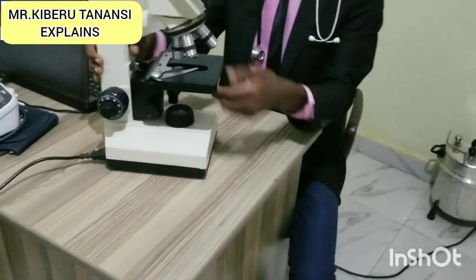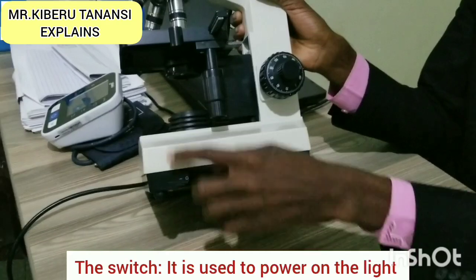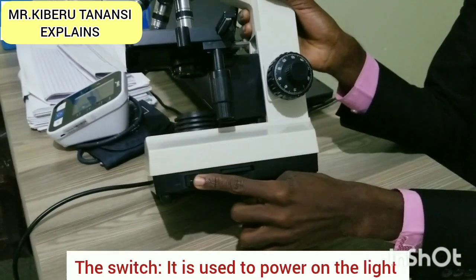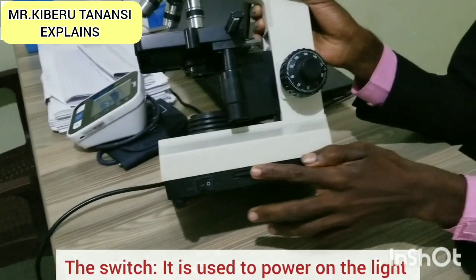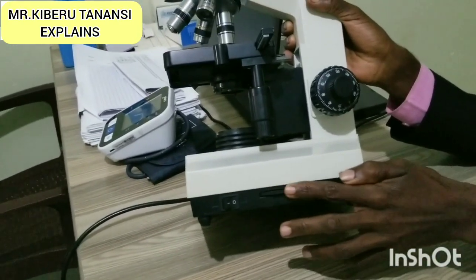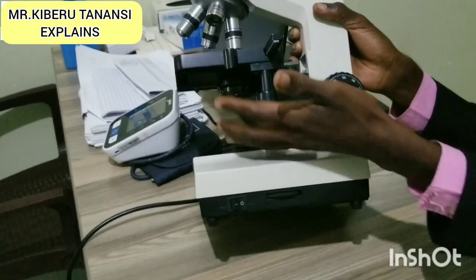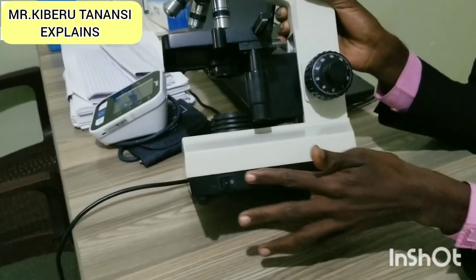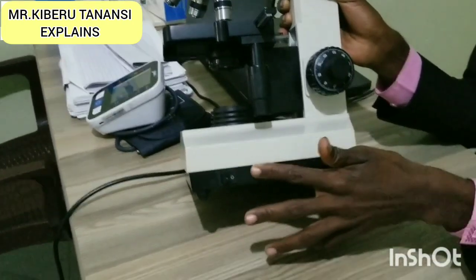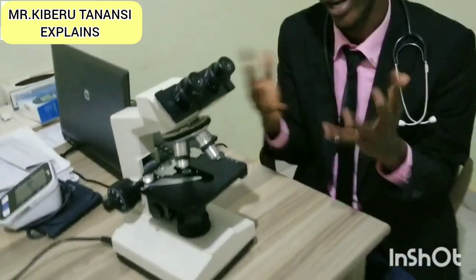From there, this modern microscope of ours has a switch here. So this is its switch. You switch it on, it gives light on the bulb. You switch it off. So you switch it on and you switch it off. From the switch, we have even this light adjuster here, which adjusts the light. When you rotate this one, the more you rotate it, the more light comes out. So you can increase or reduce the amount of light using this knob here. So simply, those are the main parts of the light microscope.